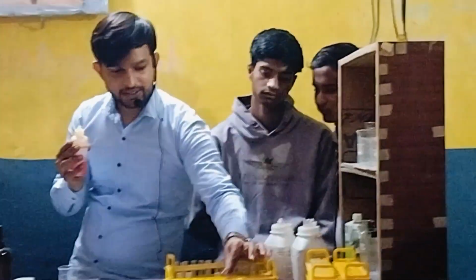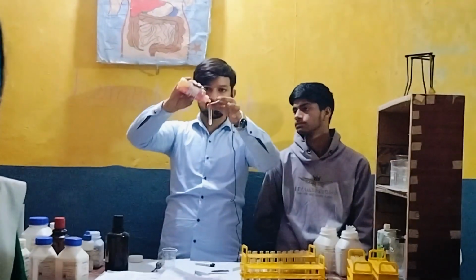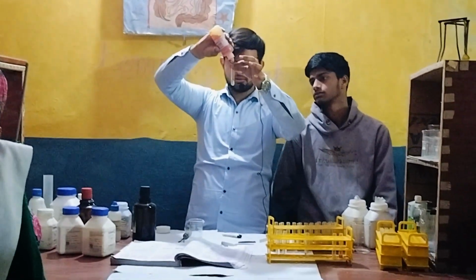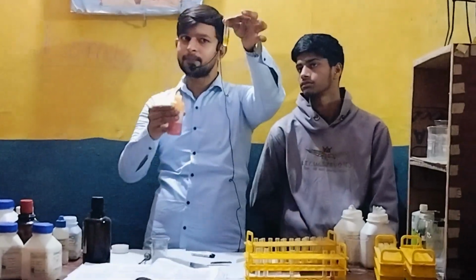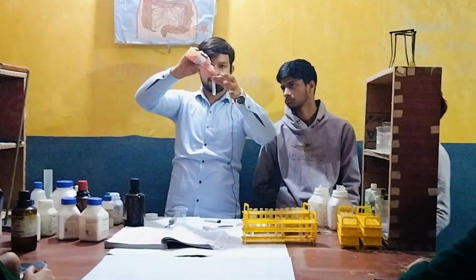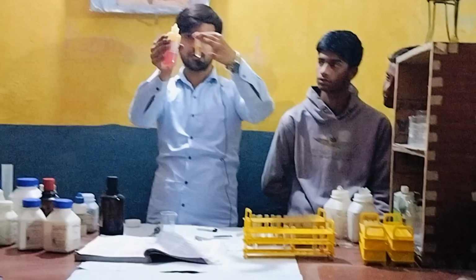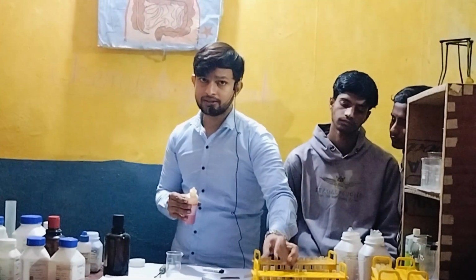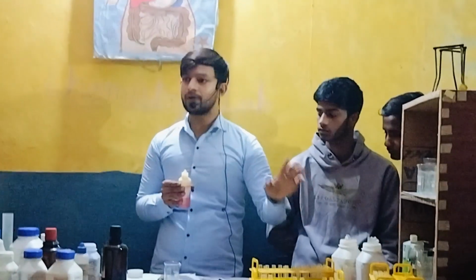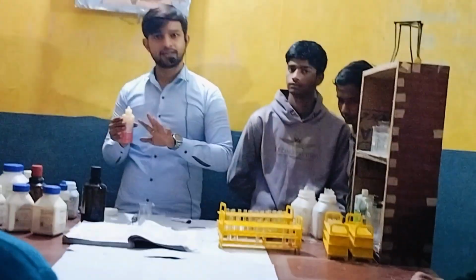And when the methyl orange is put into base, now please see what will happen. Nothing happens. Orange color, same, so nothing happens. And when we put into water, let's see what happens. Same color of methyl orange. So what we have learned is that when methyl orange is added into acid, then the color will change into red. Okay, and otherwise the color will not change.